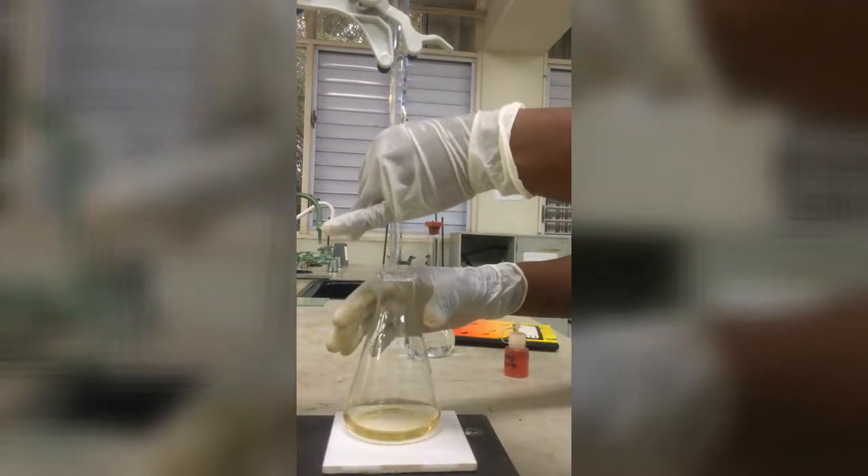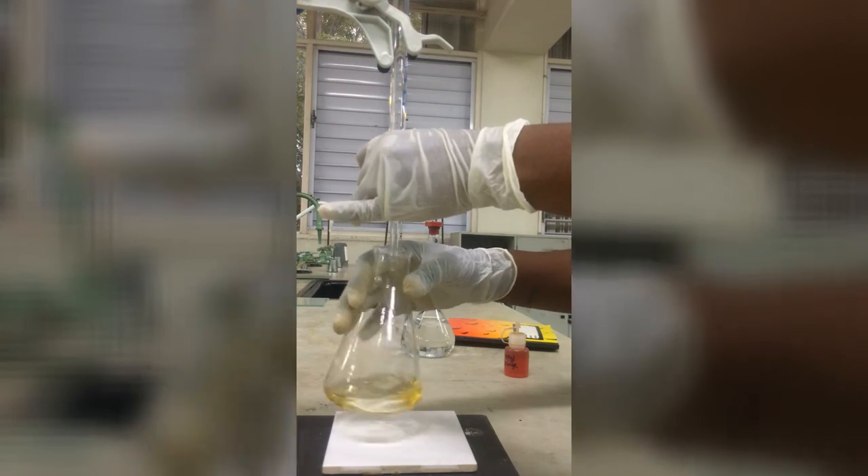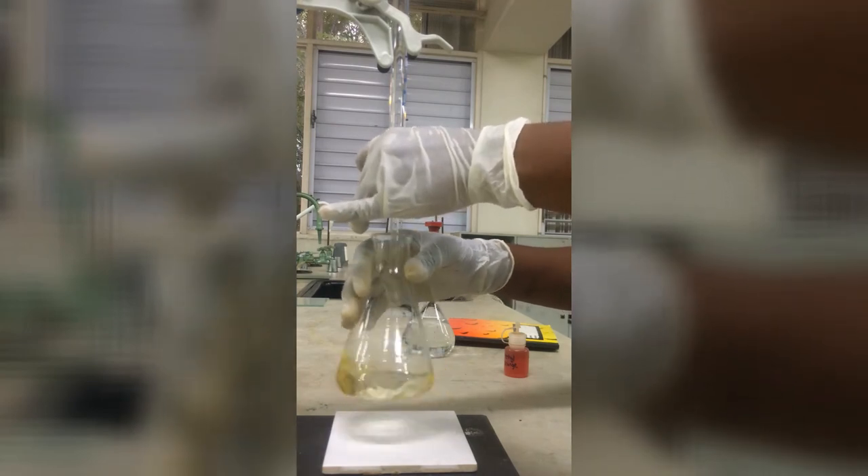Observe how she operates the burette. She swirls with her right hand and uses her left hand behind the burette to operate the stopcock.